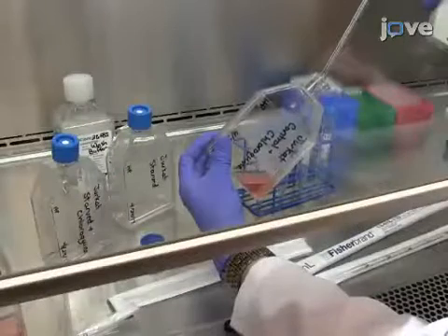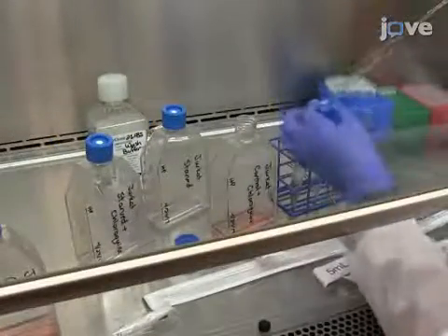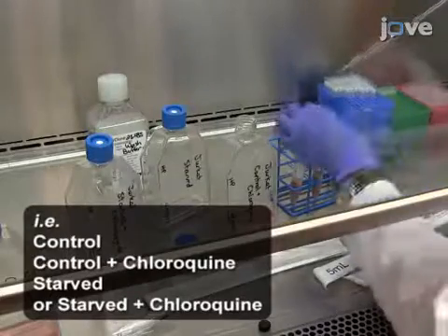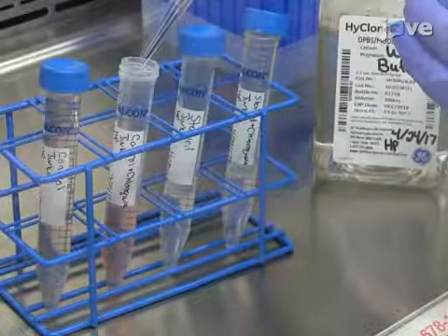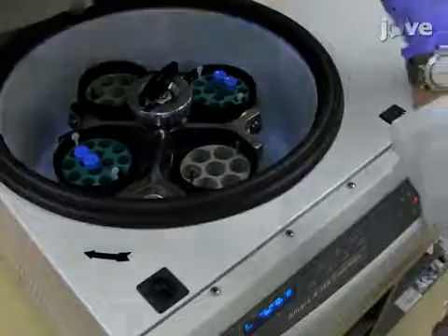Begin by adding 2 times 10 to the 6 Jurkat cells into individual 15 mL centrifuge tubes labeled with the appropriate sample names. Next, add enough wash buffer to each tube to bring the final volume of each sample up to 15 mL and pellet the samples by centrifugation.